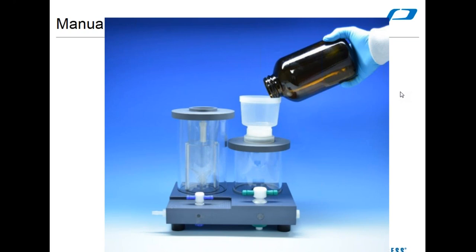You have to dry that extract somehow. I've seen some labs that will collect all the hexane extracts together and actually add sodium sulfate to the extract itself, stir it around, and allow the sodium sulfate to draw the water out that way. Then you would need to filter that out. I've got a question about the cost of the equipment. I actually do not know the cost. I'm a tech guy, I don't usually deal with the numbers. Give your sales rep a call and have them help you out on getting a quote. There is a map on our website by state showing who's in charge of what state and their links to their email addresses.